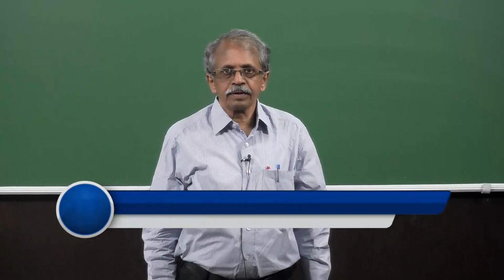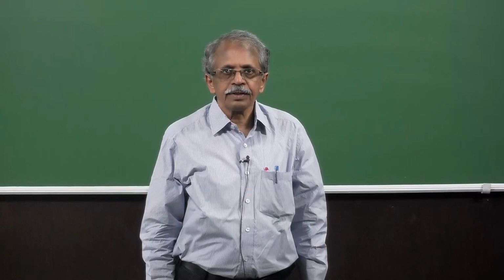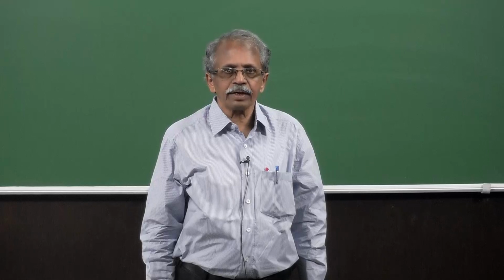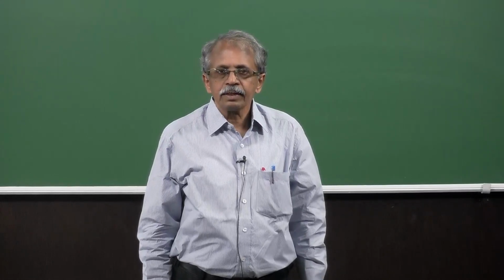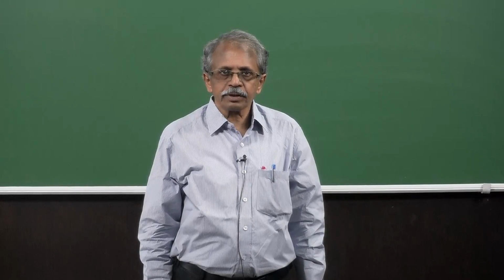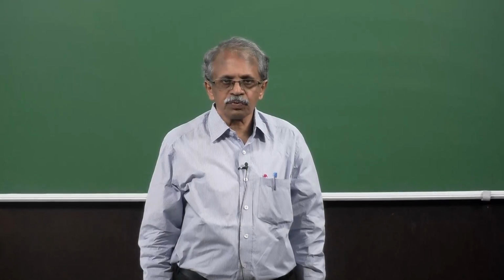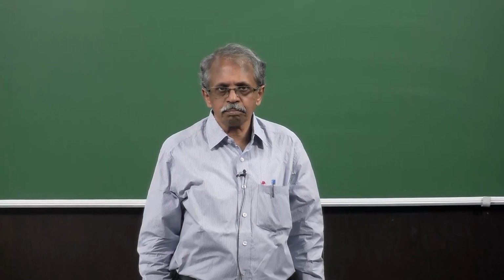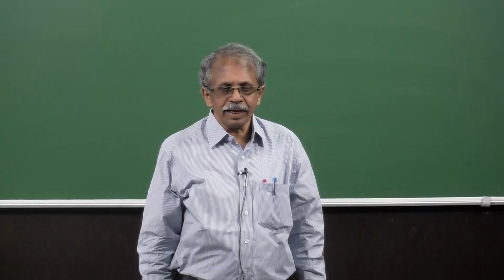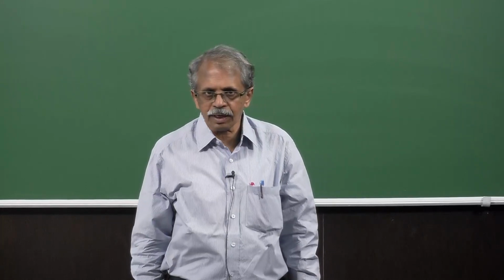Good morning. Welcome you all to this lecture in the series on analytical, spectral and microscopy applications of inorganic compounds and nanomaterials. In the past couple of classes we have been looking at one of the spectroscopy techniques which is very commonly used both for organic as well as inorganic compounds. That is the vibrational spectroscopy, which is popularly known as infrared spectroscopy, and also Raman spectroscopy.